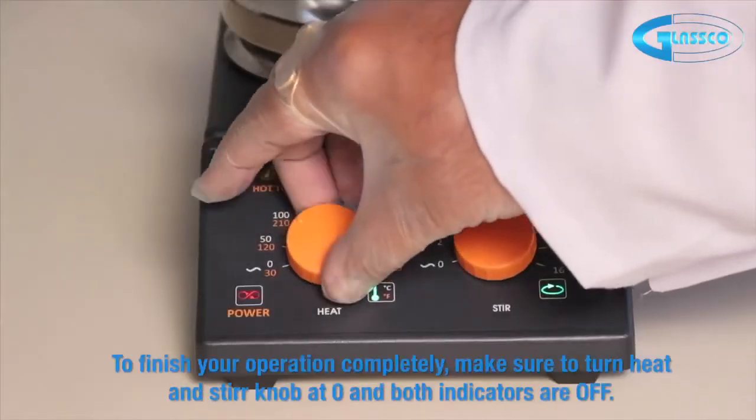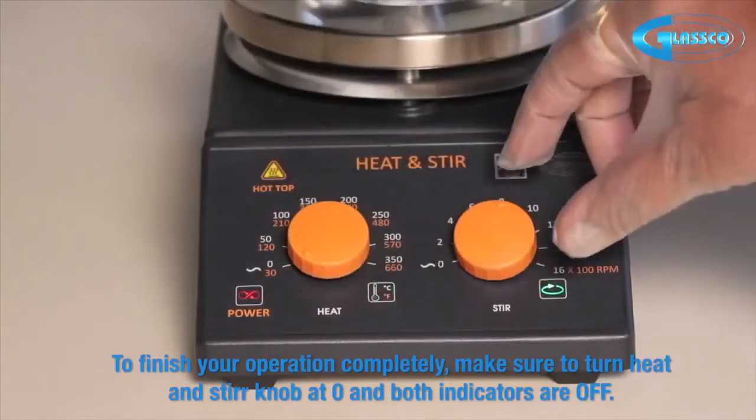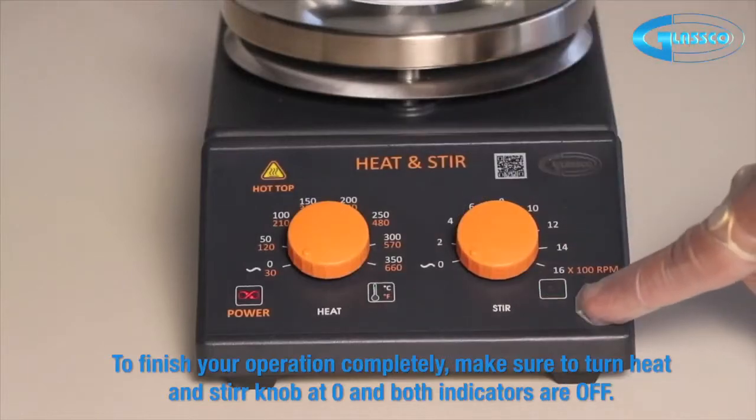To finish your operation completely, make sure to turn the heat and stir knob to zero and confirm that both indicators are off.